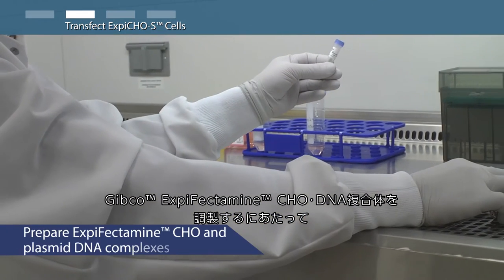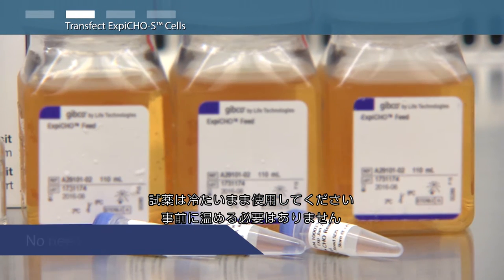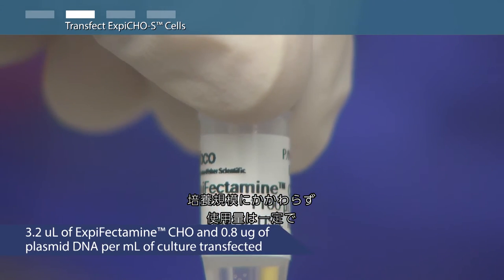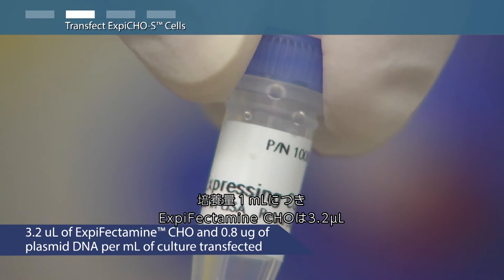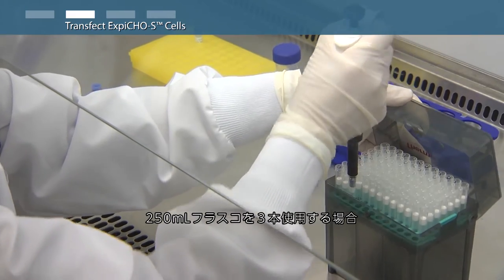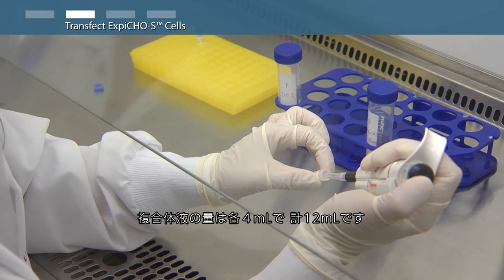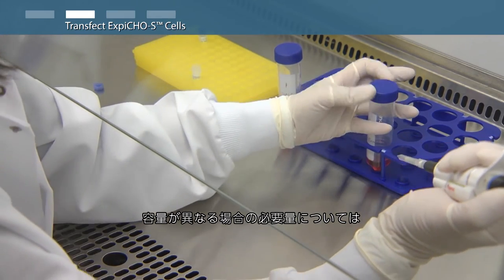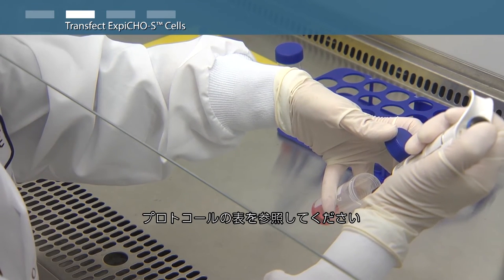Prepare ExpiFectamine CHO and plasmid DNA complexes using cold reagents. It is not necessary to pre-warm all reagents. At all culture scales you will need 3.2 microliters of ExpiFectamine CHO and 0.8 micrograms of plasmid DNA per milliliter of culture to be transfected. For triplicate 250 milliliter flasks you'll need 12 milliliters total of ExpiFectamine CHO and plasmid DNA complexes — four milliliters for each flask. You can easily scale the protocol for other size flasks by following the transfection at various scales table in the protocol.